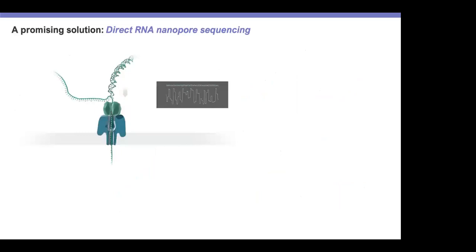That's where we got interested in nanopore sequencing, because nanopore sequencing allows you to sequence native RNA molecules, including their modifications. And therefore, in principle, you can see any given RNA modification. So how does this work for those that maybe are not so familiar? Nanopore sequencing is a third generation sequencing technology, meaning that it's a long read sequencing technology, and what you sequence is the RNA or DNA molecule.